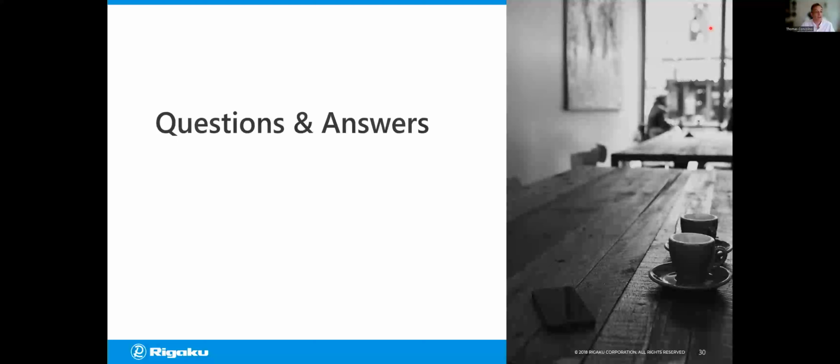Okay, all right. So we actually had the same question come in one after the other. Yeah, I saw that. Can you explain the difference between Rietveld and direct derivation? Yeah, we've got some mind readers out there.